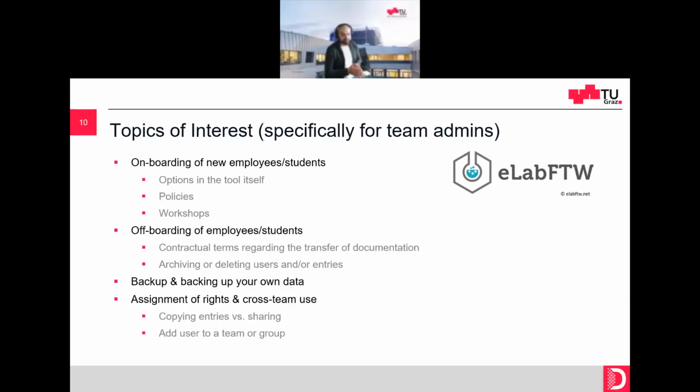Why do I mention this? Because you can add any member of this instance to a group, and this group is located in your team. So you could share specific information in your team with just one member of this group, just for this one purpose, and you don't want this person in your team at all. It is a way to make it easier to share certain information with a group of people.